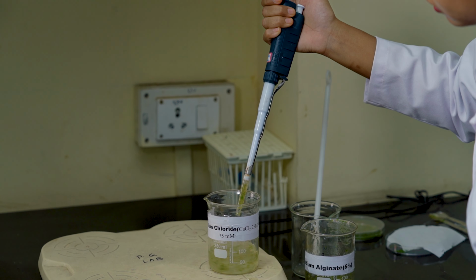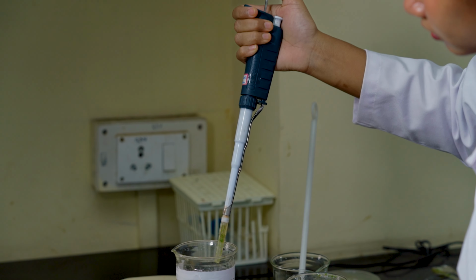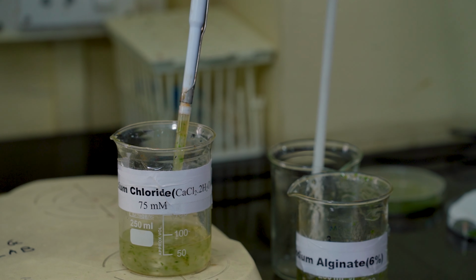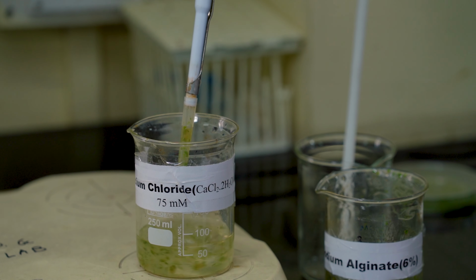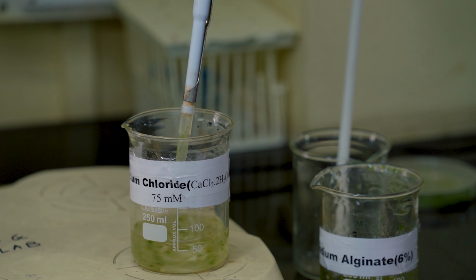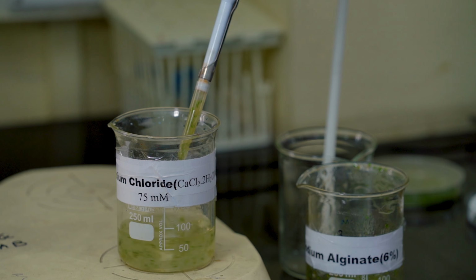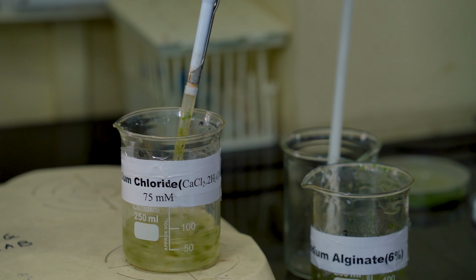The liquid should be stirred at 45 rpm all the while the dropping is done. As the drop falls into the calcium chloride solution, an ion exchange reaction occurs in which calcium replaces sodium ions, due to which a surface complex forms. This gradually hardens the drop into beads. Keep the beads in the same solution for 45 minutes for proper bead formation.